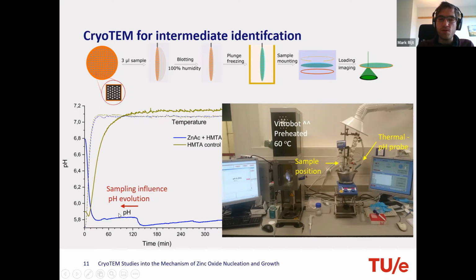And as I also told you, for Cryo TEM you need ethane in which you shoot your sample with an electronic lever, and this ethane is only good for, let's say, 10 to 15 minutes. So we found that we need even a third person who constantly makes new ethane batches, so that we can perform the reaction when the pH curve indicates that we're at a certain stage, and always sample at the corresponding moments of the transitions that we want.